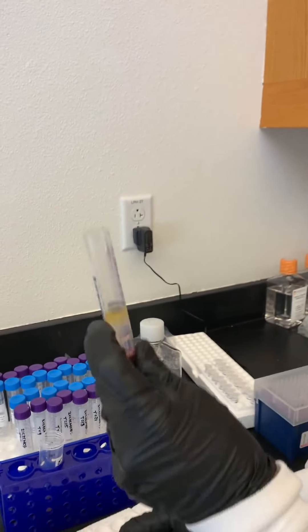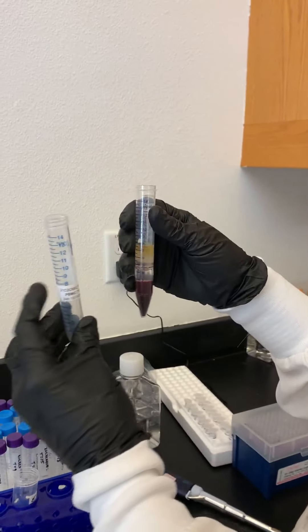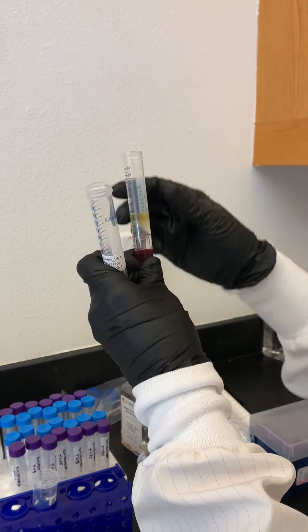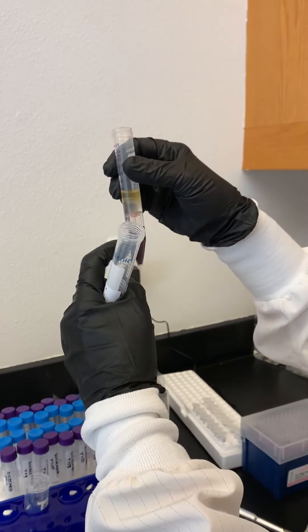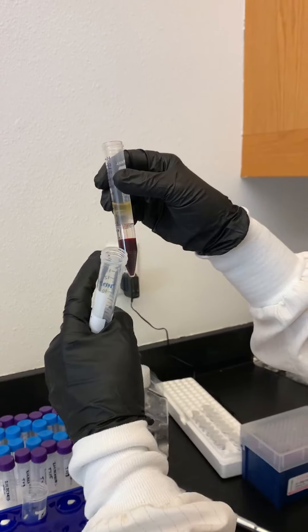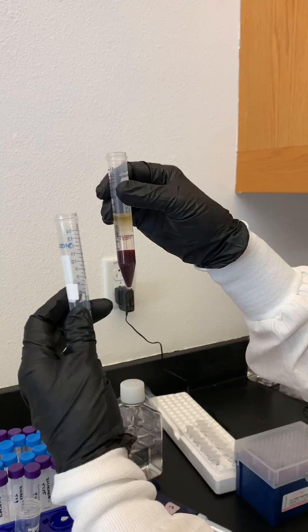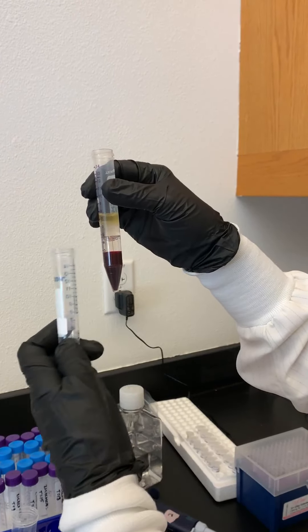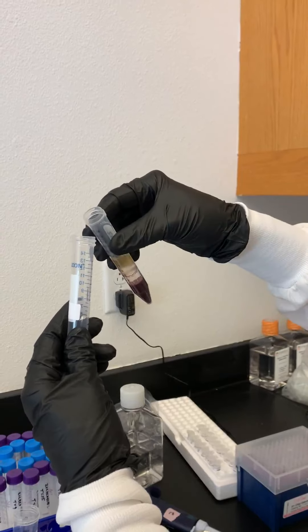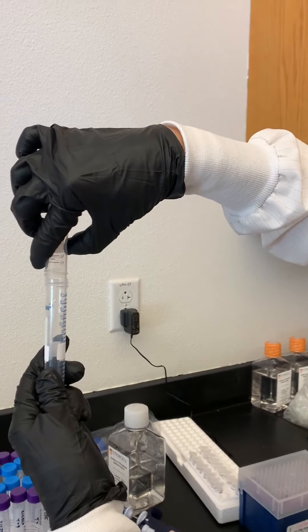Now what we're going to do is actually just dump this whole insert into the tube. Here's the tough part though — we don't want anything below the insert to come with us. And it won't, as long as we flip this over and invert it pretty quickly. If you flip it right away, the insert will block all the rest from coming. So we're going to tilt and then flip straight up and down.